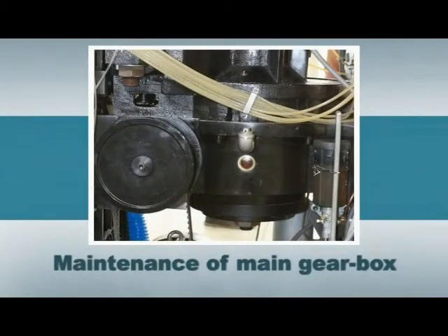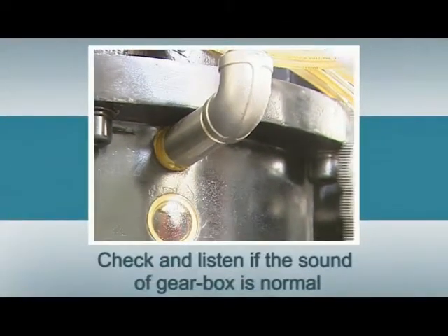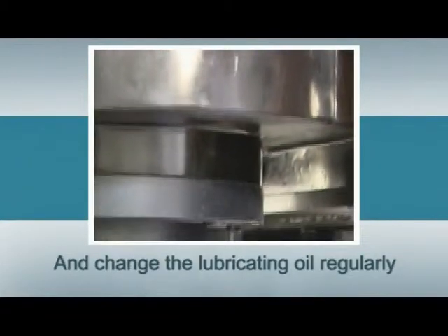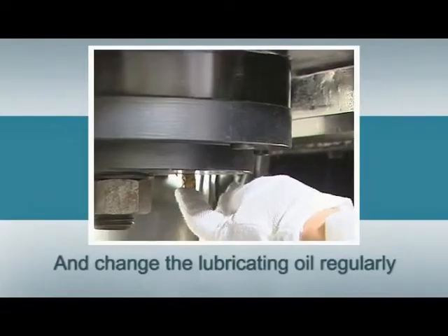Maintenance of a main gearbox. Check and listen if the sound of the gearbox is normal. Check the temperature of the gearbox and change the lubricating oil regularly.